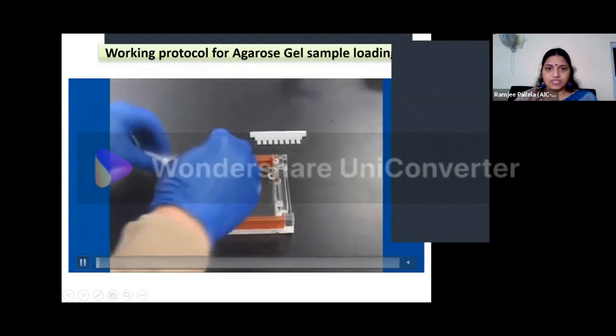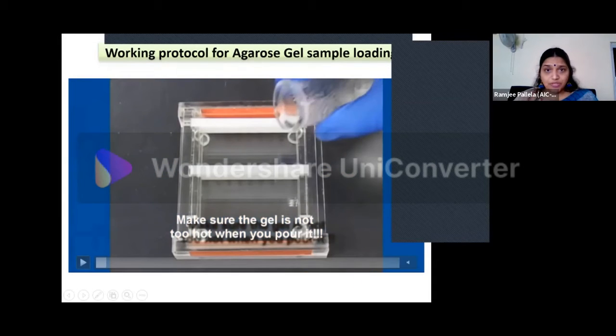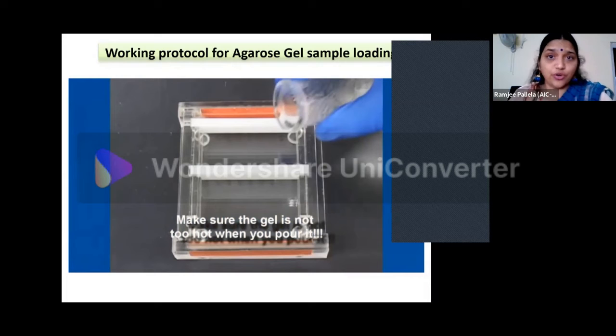See, now this step we have already seen. I told you, right, I was doing 96 samples in one particular cycle. So if I'm doing 96 samples, I have to do gel checking also for all the 96 samples. So for that checking, here you can see there are two white combs, because maybe I just need to check whether it is amplified or not. So it doesn't matter if they are resolved more or not. I just need this much space for one particular sample, so I can use the same tray for more samples in one go itself.